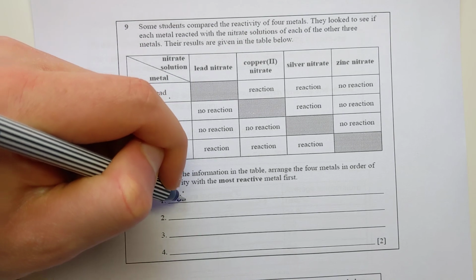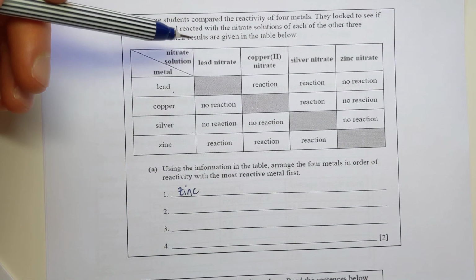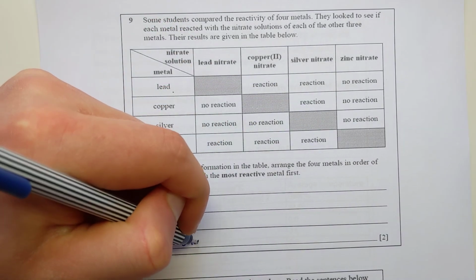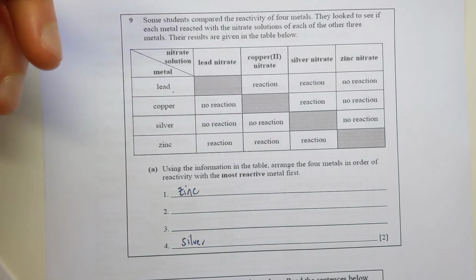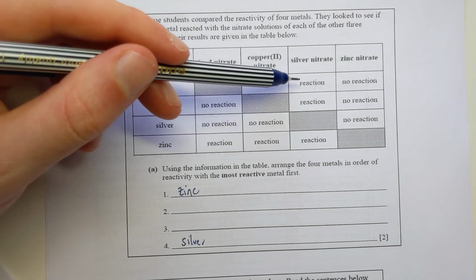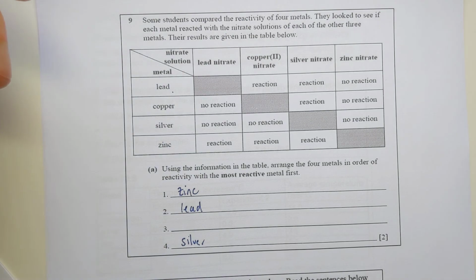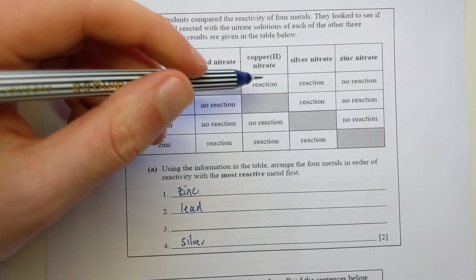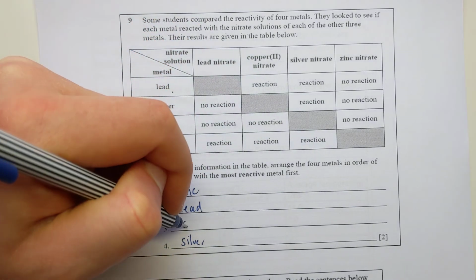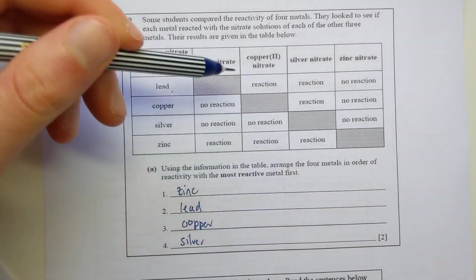It goes number 1. Least reactive, I go to the other extreme, is probably going to be silver, because there's no reaction, no reaction, no reaction. So I put it down there. Second most reactive, I would say, if I just check, would be lead, because if you notice it reacts with copper and silver, it doesn't react with zinc. Zinc's most reactive, so I put it at the top. Then third most reactive would be copper. Copper doesn't react with lead, doesn't react with zinc, but does displace silver. So therefore I put it third. So you're trying to get the correct order from things that do most reactions down to things that do least reactions.